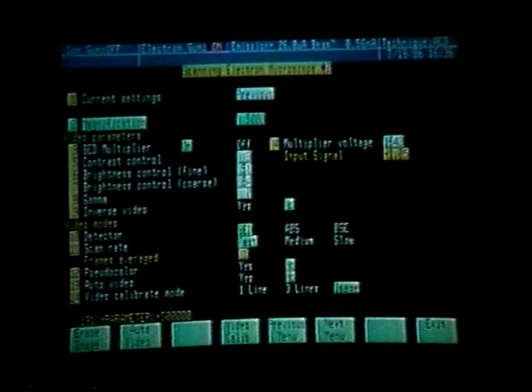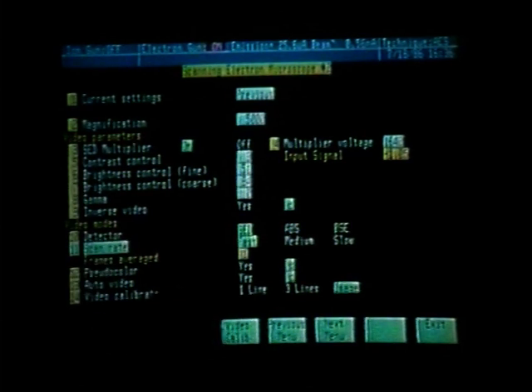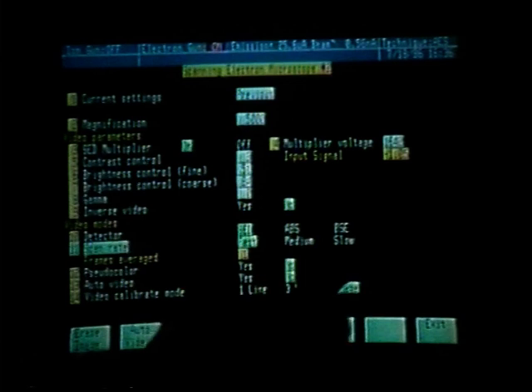We had talked previously about using the photo soft key, which was soft key number 3 on the first page of the SEM menu. That will take a picture of whatever is on the TV at the time. It will freeze that image and take a photograph of that. What I would like to demonstrate is how we can get better photographs utilizing that key by changing our scan rate. Pressing function key number 11 will allow us to toggle our scan rate from fast to medium and then to slow.